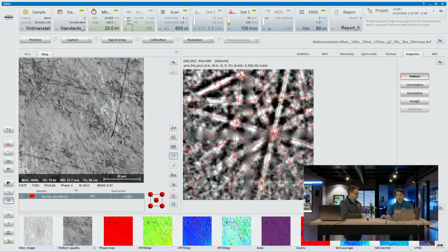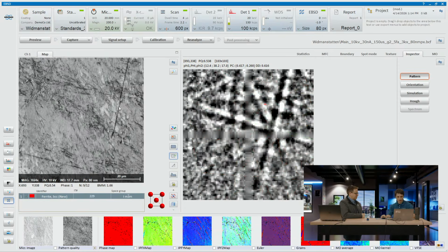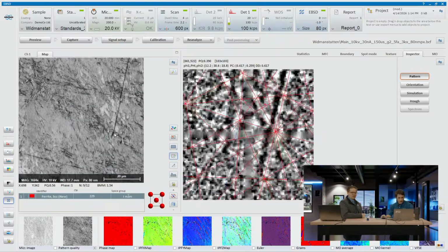Indeed. Okay. If I move to this big scratch on my sample here, this dark spot, and I'll try to get pixel perfect there. We can. Oh, maybe I'll pick the spot over here.